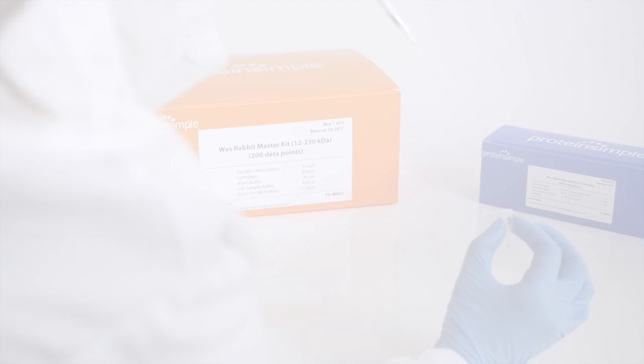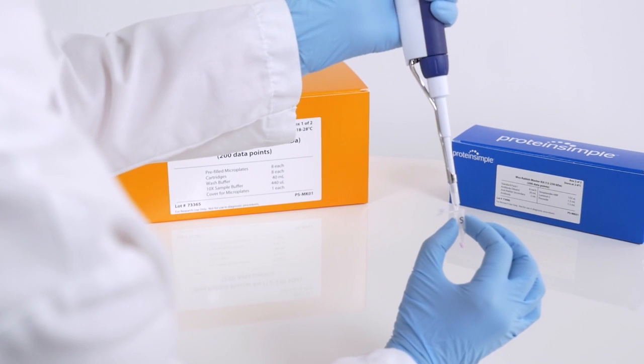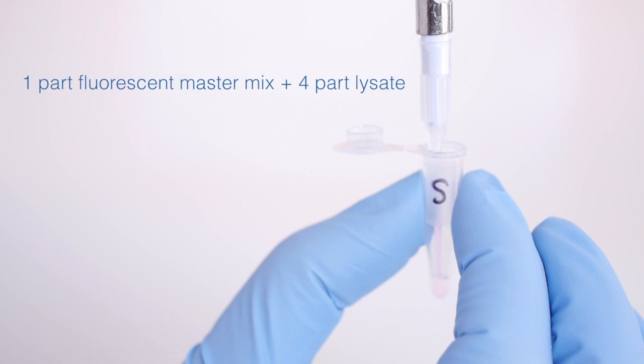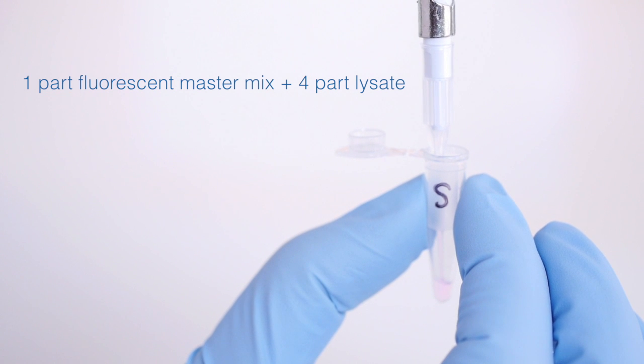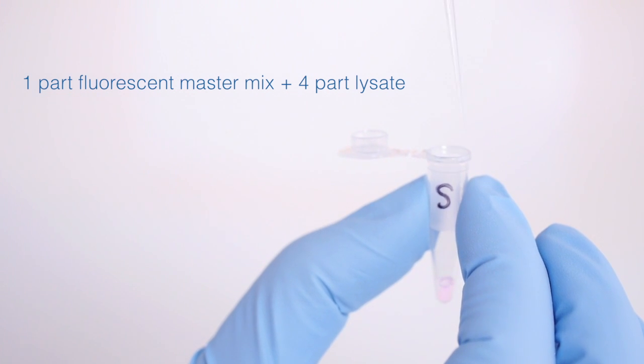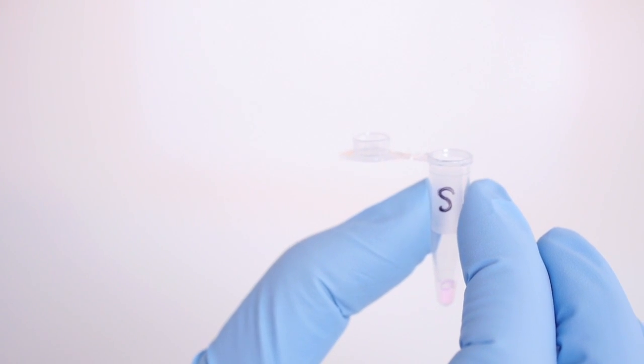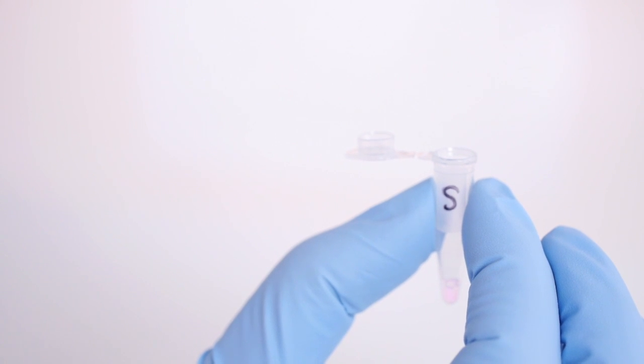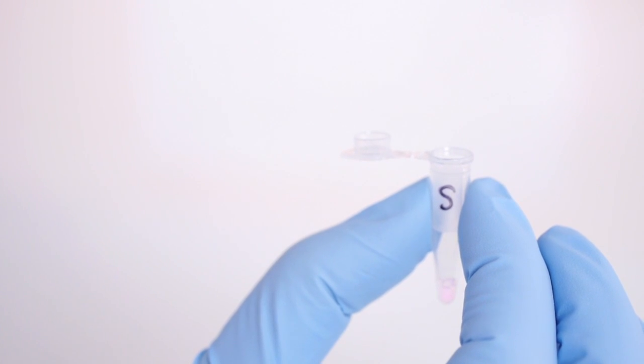Okay, let's get started on preparing your samples. Combine one part 5X of the Fluorescent Master Mix with four parts of your lysate in a microcentrifuge tube. The final concentration of your lysate will be assay dependent, but we suggest starting with 0.2 milligrams per milliliter if you're running a brand new assay.